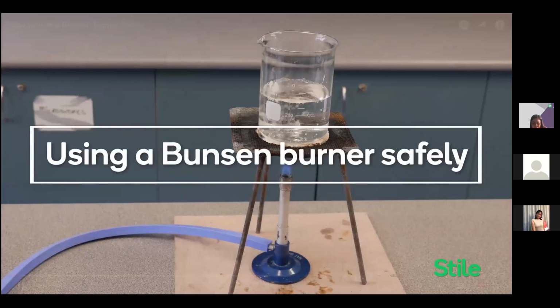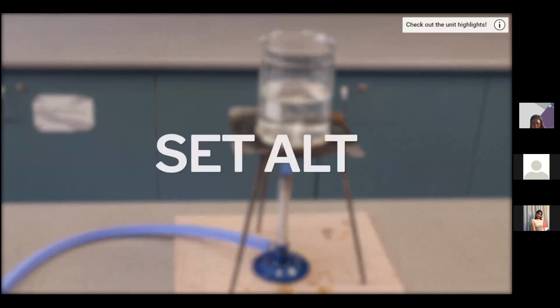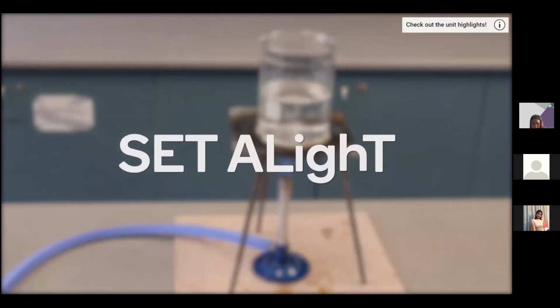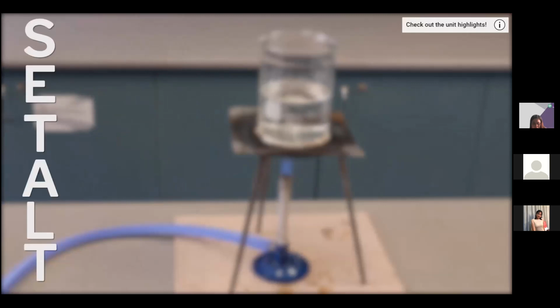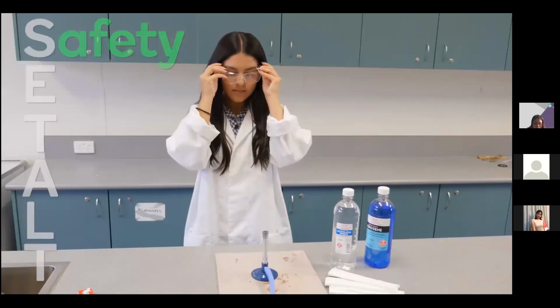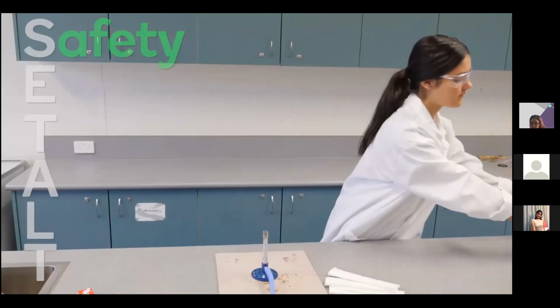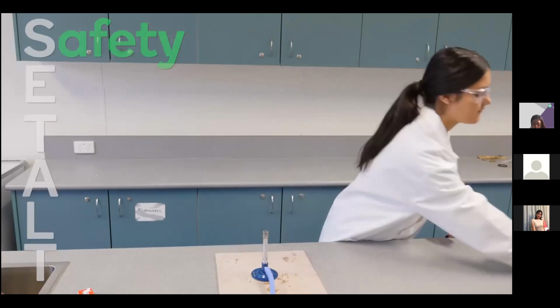The Bunsen burner is a great way of heating up substances in a controlled way, but it must be used with care. A handy way of remembering how to light a Bunsen burner safely is set a light. Let's see what this means. S is for safety, which always comes first. Make sure you're wearing a lab coat and safety glasses. Tie back long hair and clear your bench of anything that's flammable, meaning that it could catch on fire.